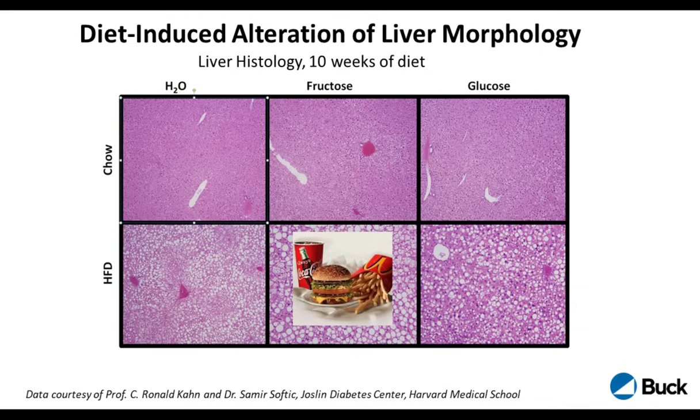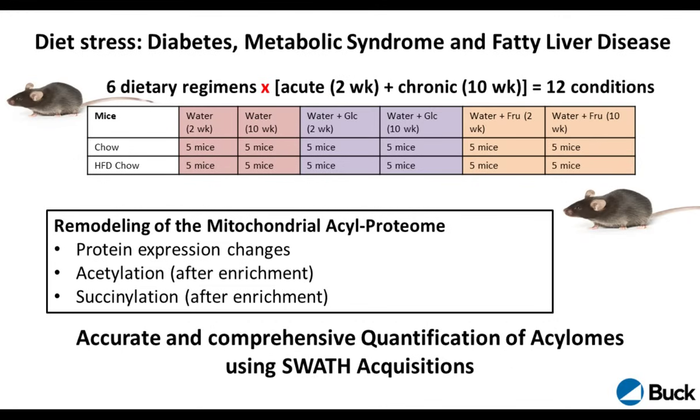The systems we were looking at were actually kind of interesting. The image doesn't look as good here. I'm not sure why that is the case. But this is supposed to show you a liver histology. And we were looking at different conditions here in feeding. So maybe I can just rather show you on the next slide.